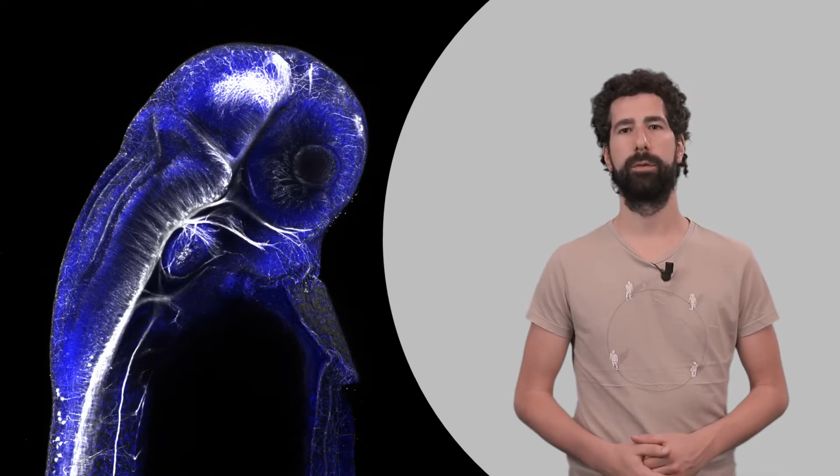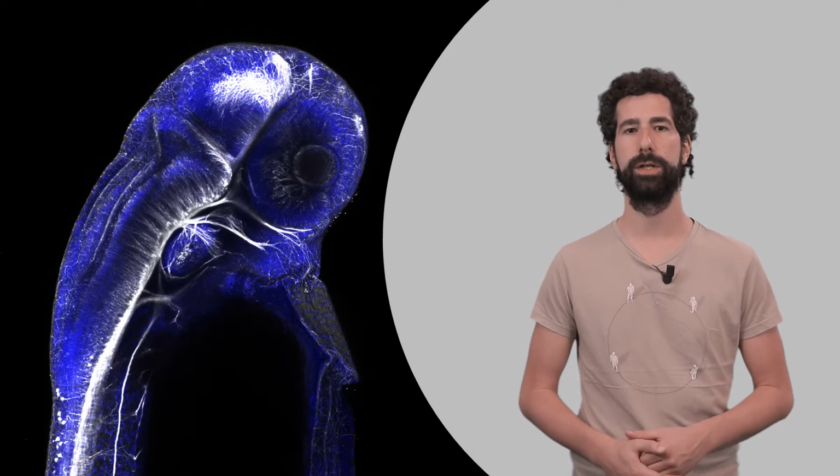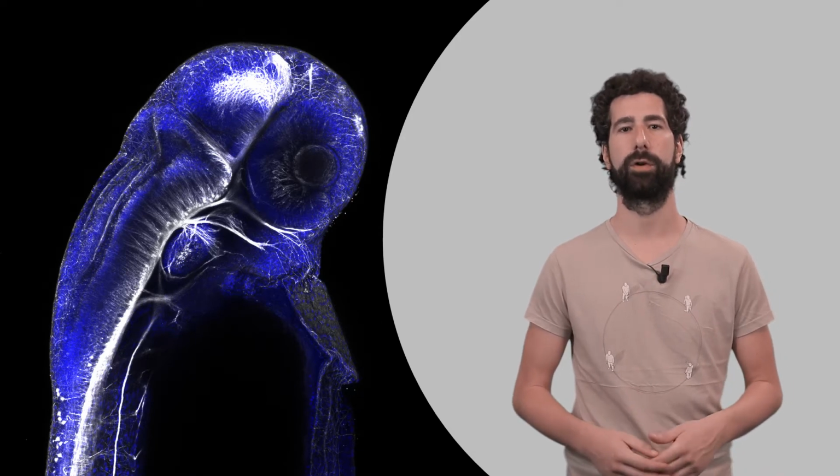Hello everyone, and welcome to a new lecture about microscopy. The aim of this video is to overview the principle of confocal microscopy.